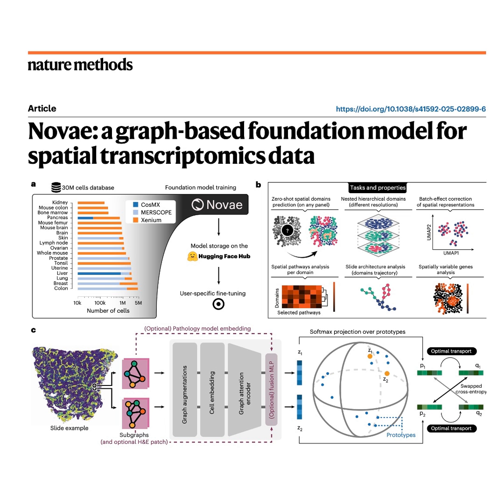And it's robust against the segmentation method, too, since it worked regardless of whether the input was from the 10x Genomics default or the Baysor method. That's some serious stability. Let's move to the payoff, the biological insights this new engine revealed.